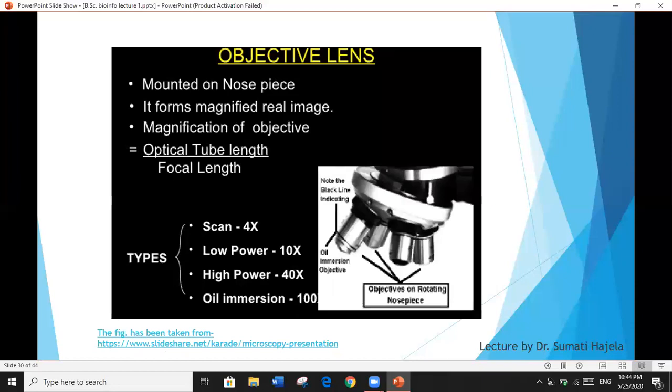Objective lenses: more about objective lenses. You can see here these are mounted on nose piece. It forms magnified real image and magnification of objective, as you have already seen, may be divided by optical tube length divided by focal length. And types of objective lenses are scanning lens, low power lens, high power lens, and oil immersion. These objectives are fixed on rotated nose piece. This immersion objective lens is marked separately by a black ring line indicating that this is immersion objective lens. Each lens has its details written on this part of the lens.